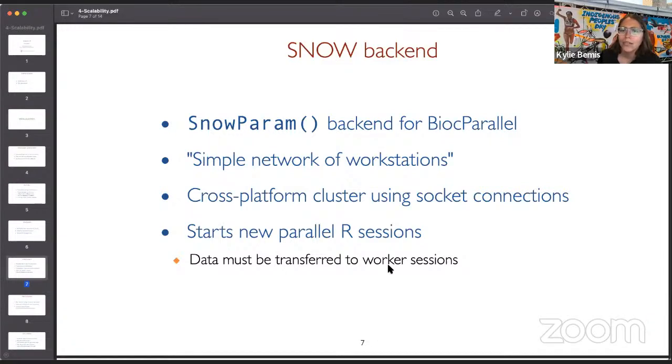I know that you can call some Python packages, like Keras and TensorFlow, that can use GPUs, but I'm not sure of a way to directly utilize GPUs from R. You can, of course, call C and C++ code from R.